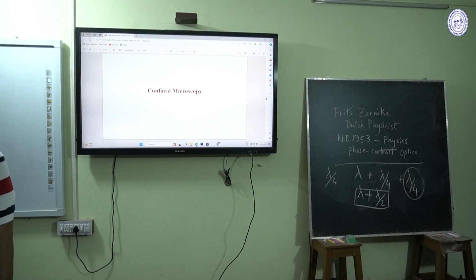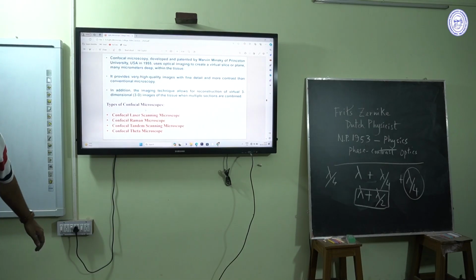Now I am coming to confocal microscopy. Confocal microscopy was developed and patented by Marvin Minsky of Princeton University, USA in 1955 when he was a PhD student.